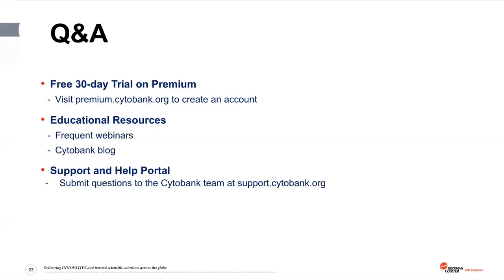So first of all, for the raw sequencing realignment, Cytobank doesn't support that. So you cannot upload a FASTQ file to Cytobank, sorry. You should get help from a bioinformatician, or you can use the Cytobank data analysis consulting service to help you process your FASTQ file.